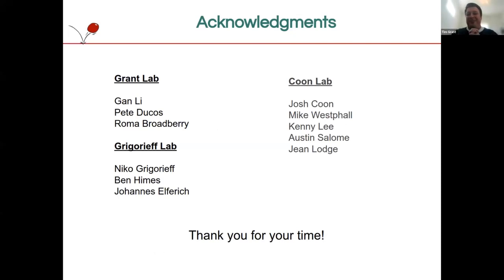Any questions? Hi, thank you, Tim. That was really cool. I just had a thought about your prepping the grids by the mass spec method. Just while you're getting your vitrification sorted, have you thought about maybe just doing cryo-negative staining, which would be very similar to preparing for negative stain, and then you can just plunge into liquid nitrogen. I don't think it even needs liquid ethane, and then you wouldn't be limited by the grain size. It'd be about 10 angstroms, which I guess would give you a bit more information about if the cryo-EM is happy, just as a stopgap to sorting out the full-on vitrification, if you see what I mean.